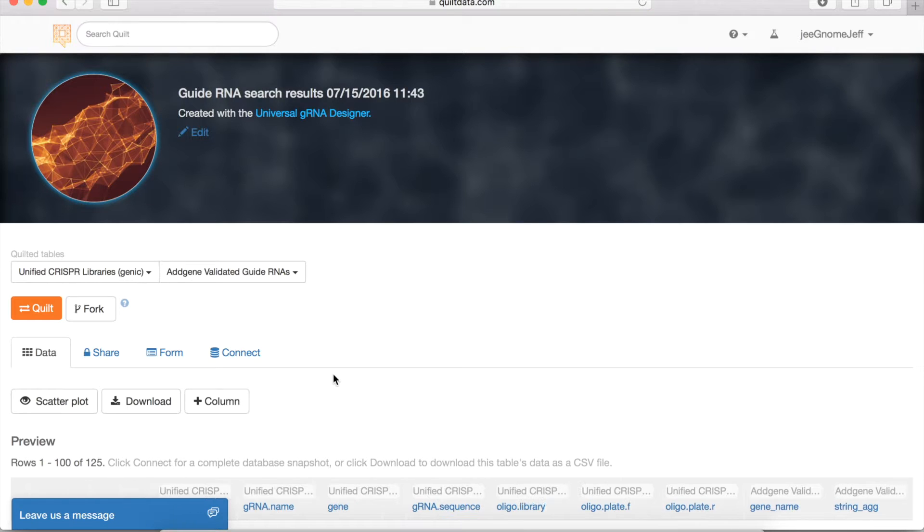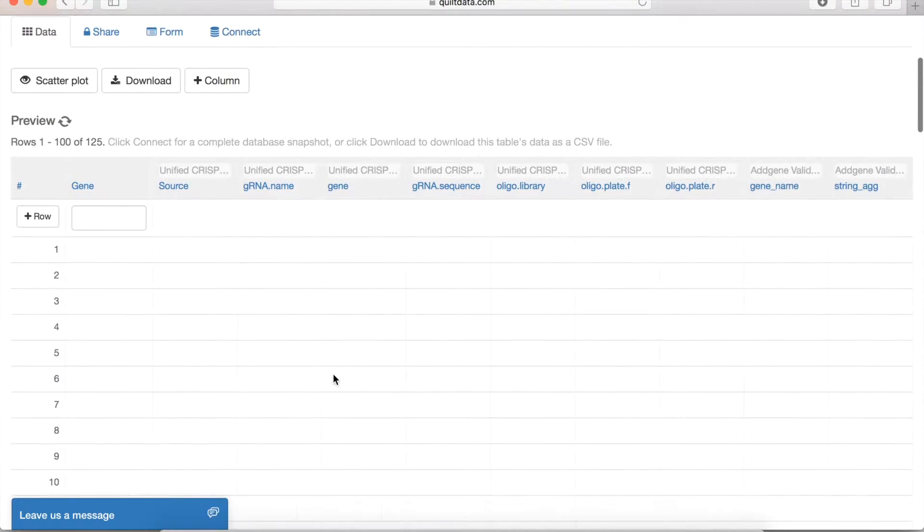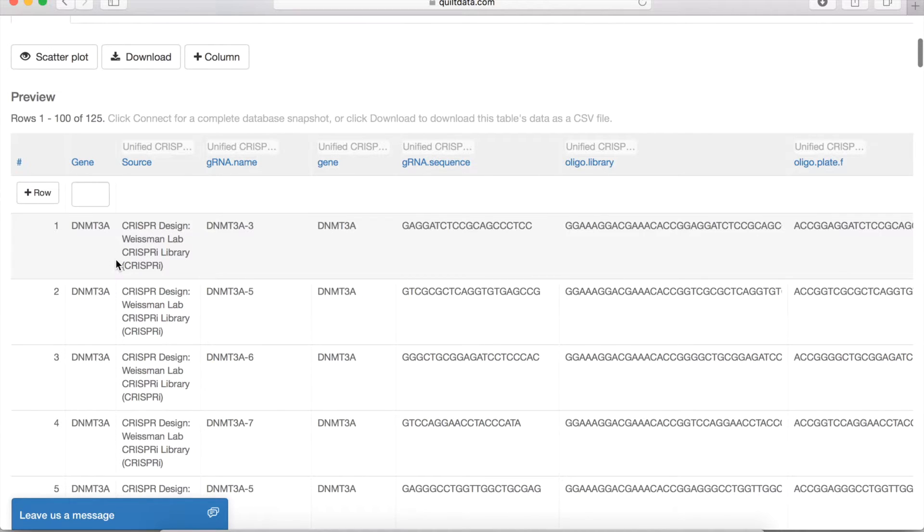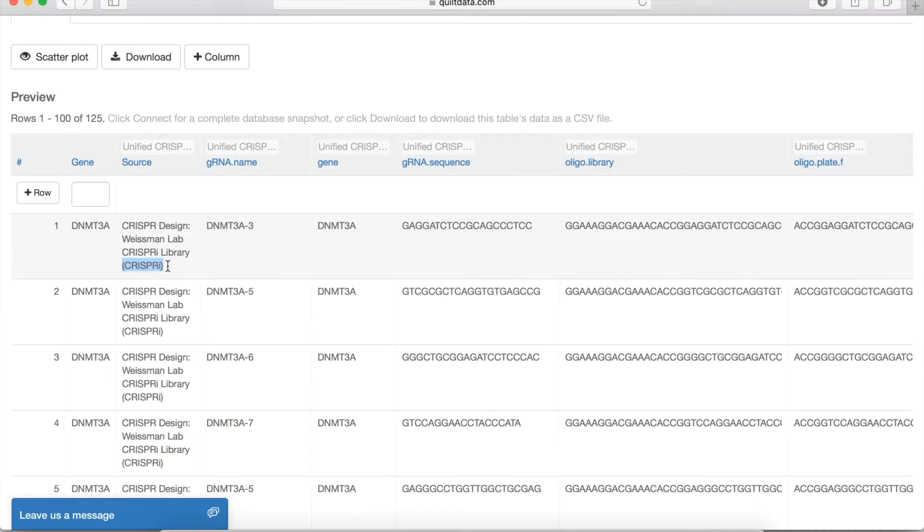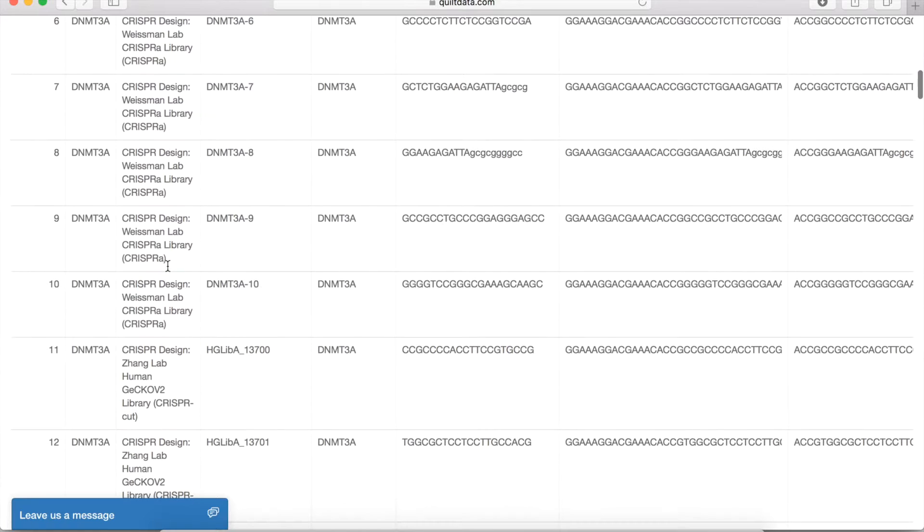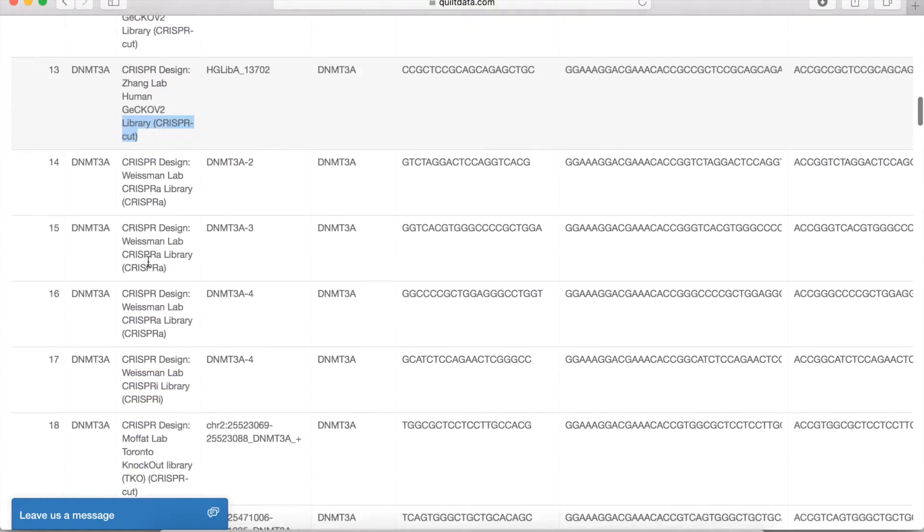What comes back from this search are matches on the gene name that you entered in various libraries and various types of CRISPR technology. So here you're seeing guide RNA designs for CRISPR interference. There's also CRISPR activation, and then traditional CRISPR double-stranded cutting as well.